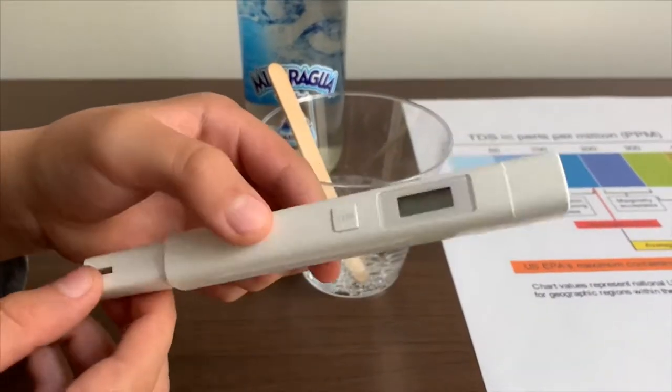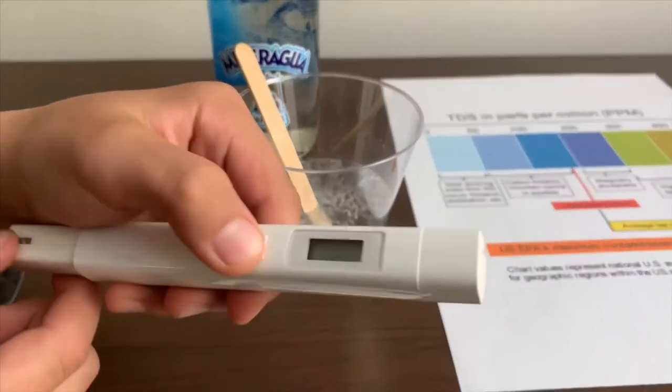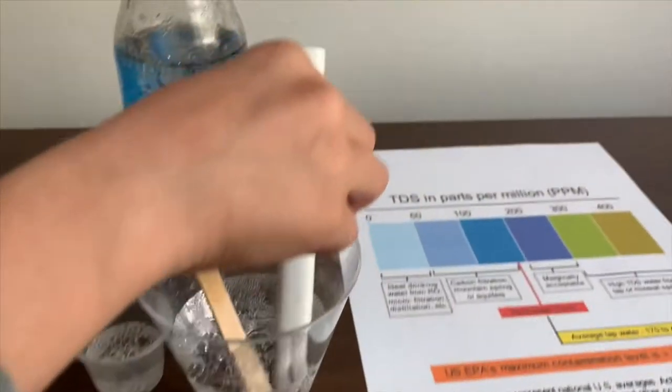If you want to buy this TDS tester, the link is down below. Turn on the TDS tester, make sure it says 0 and put it in.